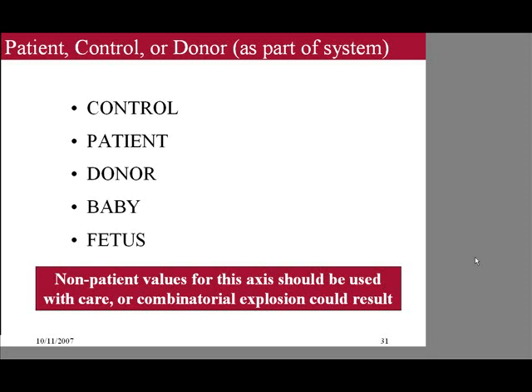That's what I meant by saying you can do a post-coordinated approach, or you can do a pre-coordinated approach. If you're doing the post-coordinated approach, you would have another field in the message that says subject, and that subject could be a patient, or a flock, or a group of people, or a cohort in a study, and you could specify that in a separate field, and then just have the measurement that you were measuring for that person or group. But when you say case, is that a patient, a person? Oh, yes, but sometimes in public health the case could be an animal too.